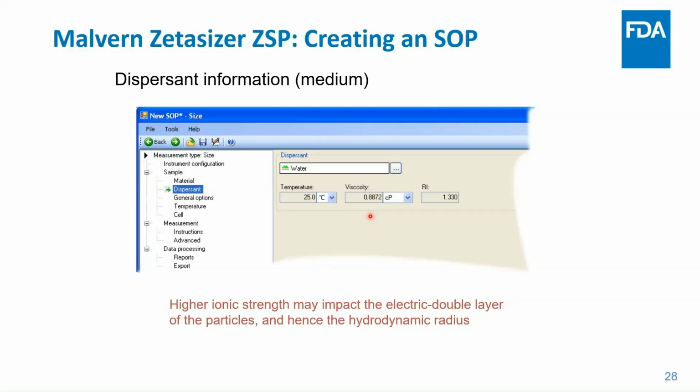And so in the system, there are a number of dispersants as well as a number of temperature dependent viscosity corrections if they're making measurements at different temperatures for the purpose of stability testing or whatever. But it's always important to double check what temperatures and viscosities they're using and whether or not that matches the expectation.